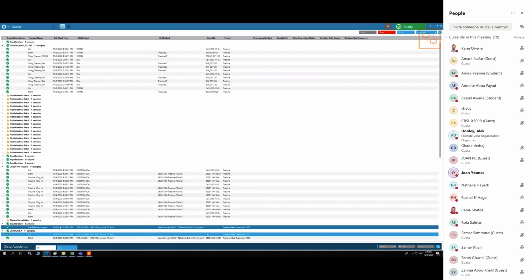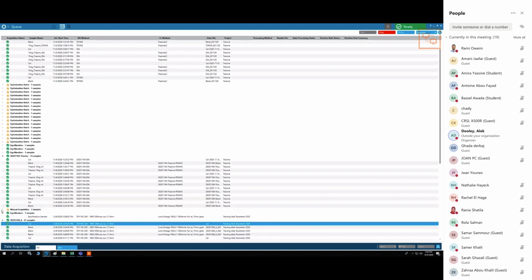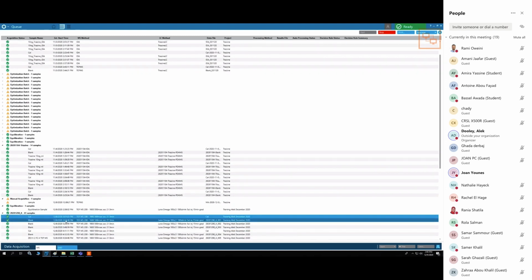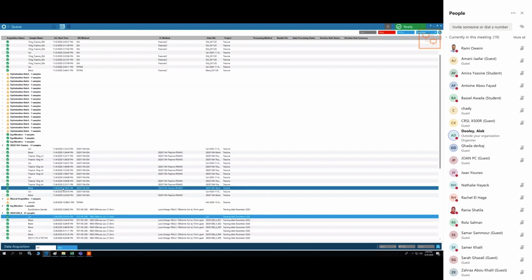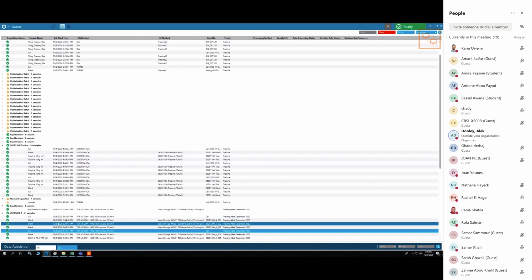No, I mean today, not the old ones. Right. Wow, so the system wasn't used for a month? Yeah, that's why I'm pretty much amazed, because usually if you don't use the system for a month, then you have something like 40 ppm.